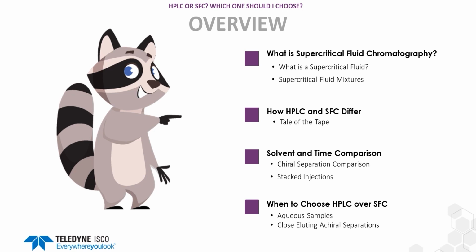We're also going to look at stacked injections and what that means for your laboratory. How much solvent and how much time will stacked injections save you? And then we're going to dive into where you might want to choose HPLC over SFC. A large portion of this webinar, especially early on, is going to be very favorable to SFC. There are a lot of pros that the supercritical fluid allows a user to take advantage of with SFC. So at the end, we're going to go over some areas where HPLC might be used over SFC: some aqueous samples, and also some close eluting achiral separations.